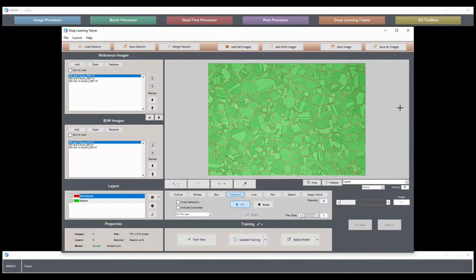Now we'll take a look at the solution initially on the images that were used for training, but then we'll make sure to look at images that weren't at all part of the training set, since that, of course, is always of primary interest: how well this tool can learn and apply to images that it never saw before.